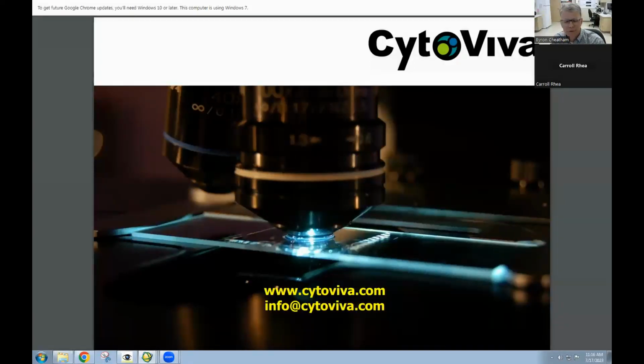Absolutely, it could. If there are ferrous-related materials inside an organelle in a cell, it's absolutely possible that they could have an effect on the optical spectrum of the nanoparticle. And that's either good news or bad, right? If you're trying to understand whether there are ferrous native materials in the organelle, hyperspectral imaging is going to potentially help you identify that. Or if you don't know they're there, it could be a limitation you'd have to work through. So there's not a perfect answer for everything. There's always an if and a but to some of these issues that we have to deal with.